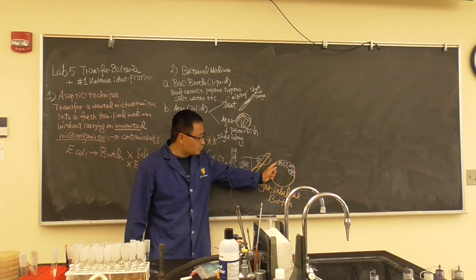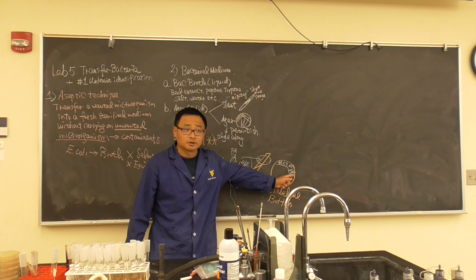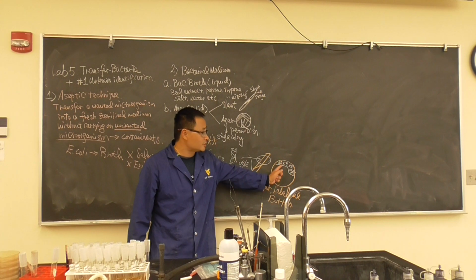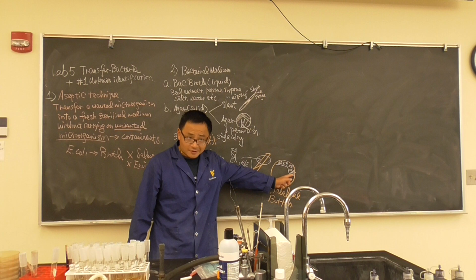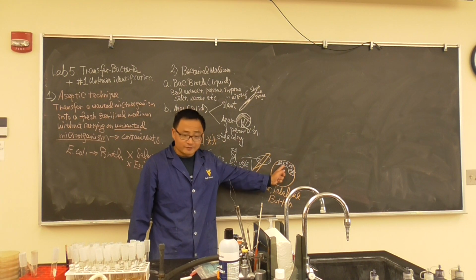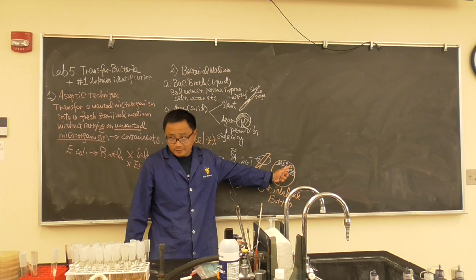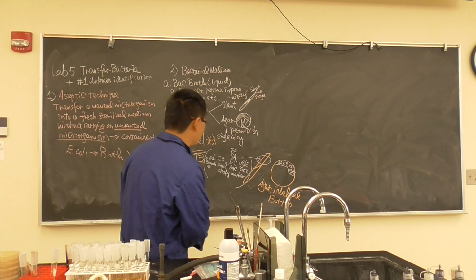It happened that I wrote this, then half of the classroom wrote like that. Then that means nothing. So that's your bench number, your initial, your bacteria, and the date. Make sure you understand. If not everybody follows me, then they're meaningless. That means it doesn't label at all. Is that right? Okay, so you understand.